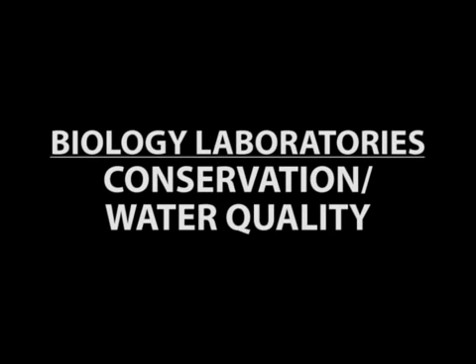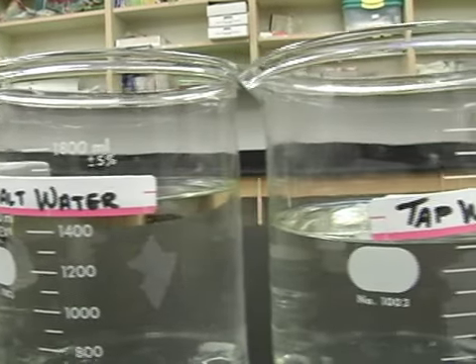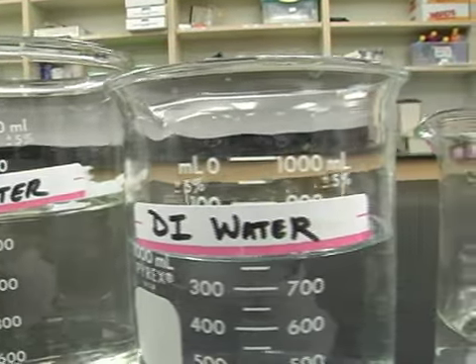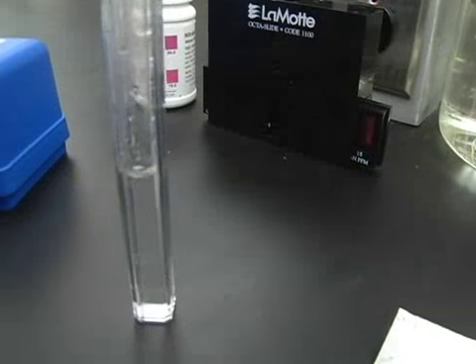In this lab, we will test the water quality of various samples collected throughout the area. The samples are tap water, wetland water, canal water, seawater, and deionized water for a control. We will begin with canal water.